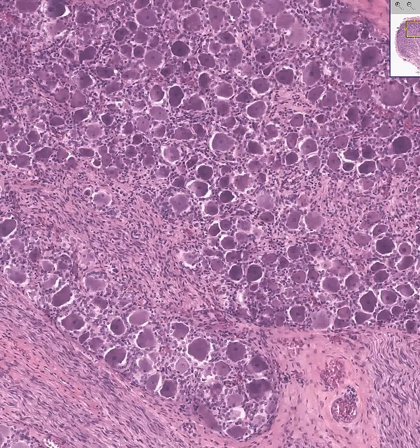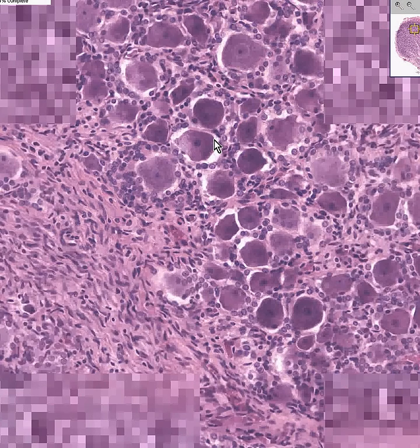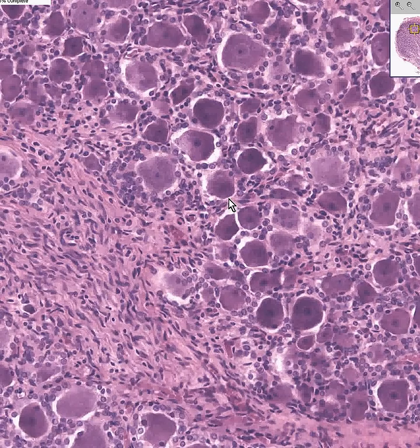Can we go a little bit deeper? Yes, we can. The various types of neurons in the body can be classified by generally function and shape. In these neurons, which are classical neurons, you could see Nissl substance, you could see a nucleus, you could see a good nucleolus. And you could see a little rim of protective satellite cells, which are a special type of glial cells for dorsal root ganglia. They protect and nourish and help these big neurons much in the same way astrocytes do in the central nervous system.